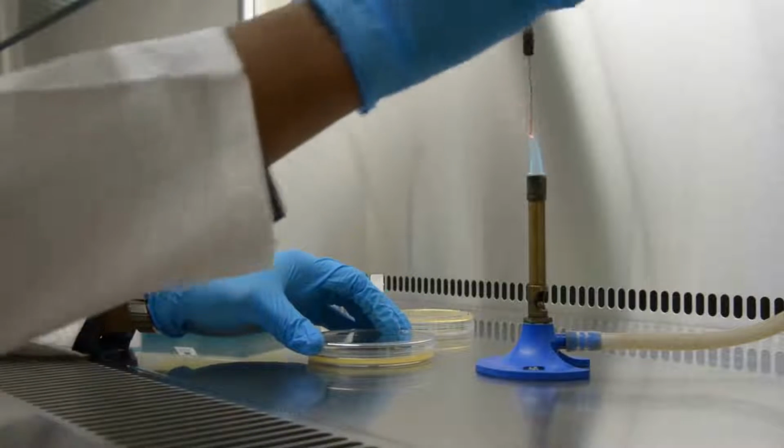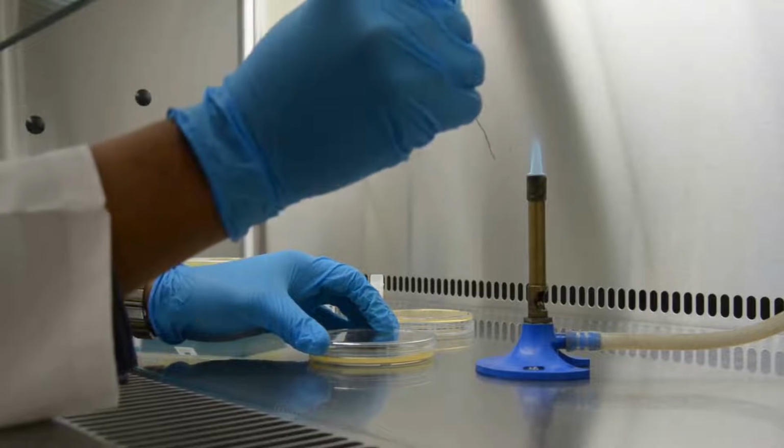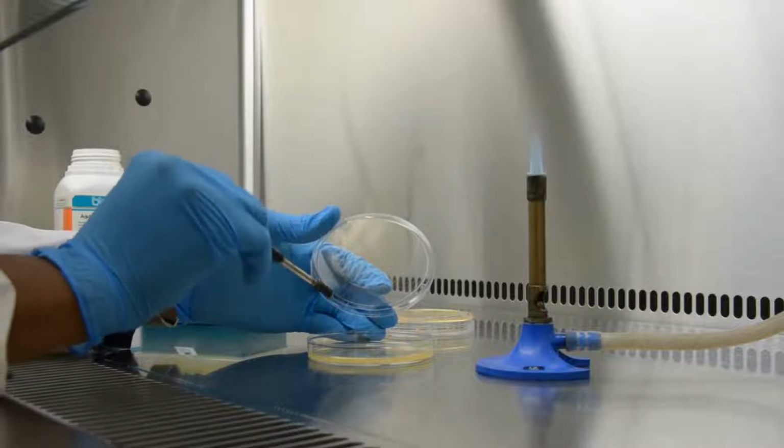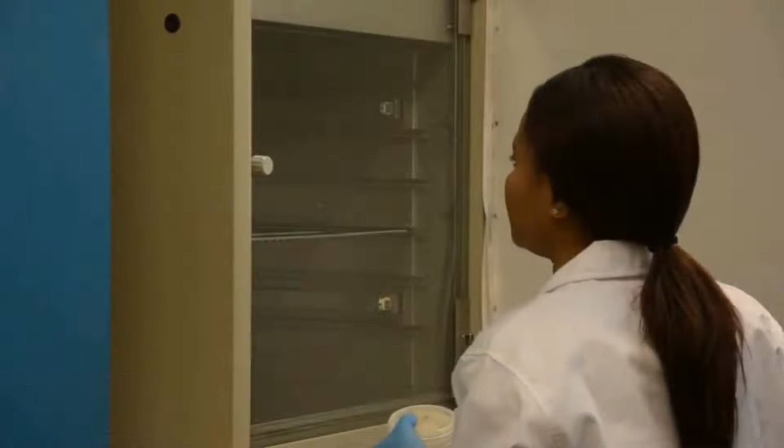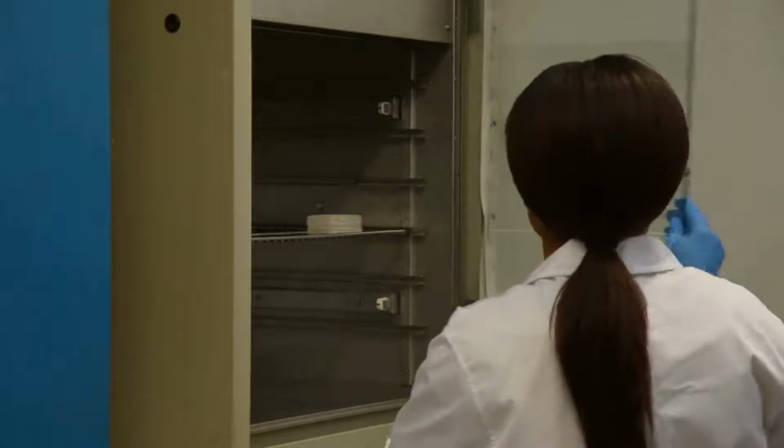Streak out the test fungal strains on YPD agar plates. Incubate the plate for 48 hours at 30 degrees Celsius.